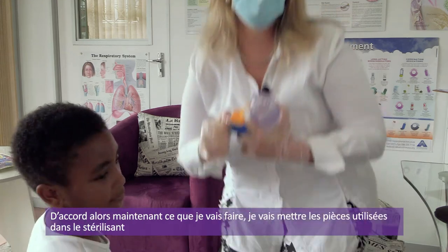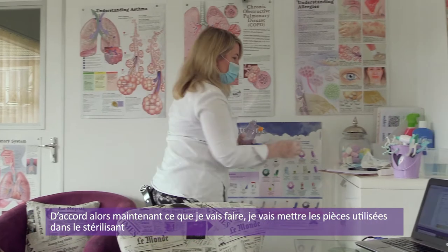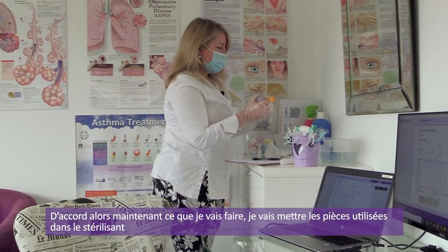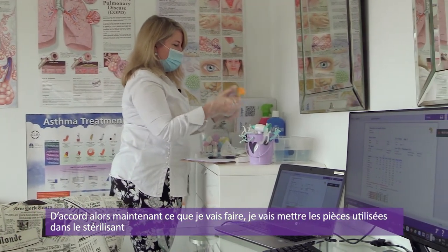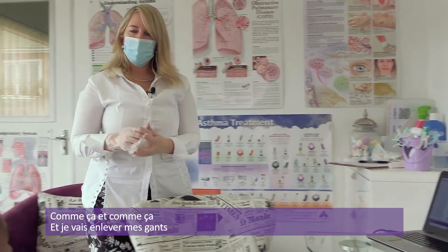Okay, so now what I'm going to do is I'm going to put my used pieces into the sterilant. Like that. All right, and I'm going to take my gloves off.